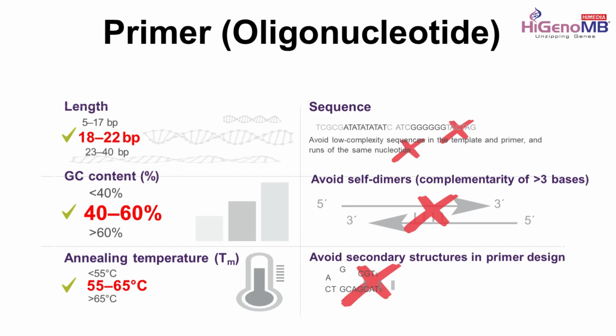A repeat is a stretch of nucleotides occurring in tandem, for example, ACT appearing in tandem. These sequences should be avoided because when they are present, it is difficult for the primers to find the specific regions and this will lead to non-specificity.